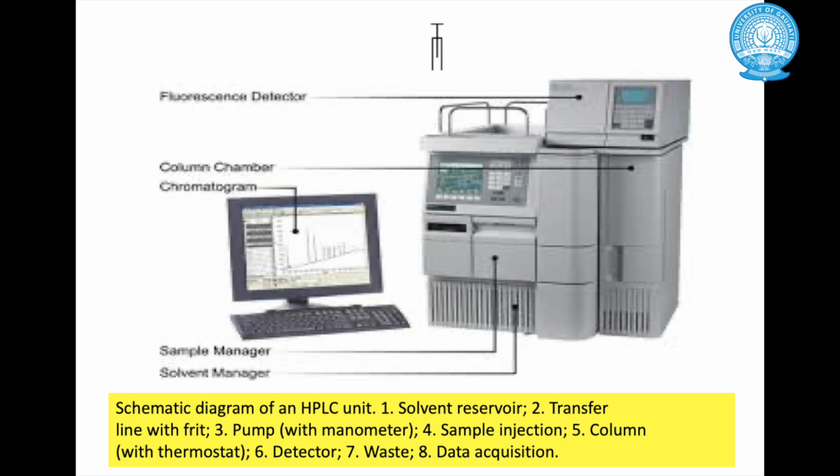This is also called octadecyl silane because of the octadecyl moiety which is attached to the hydroxyl group of this silica.